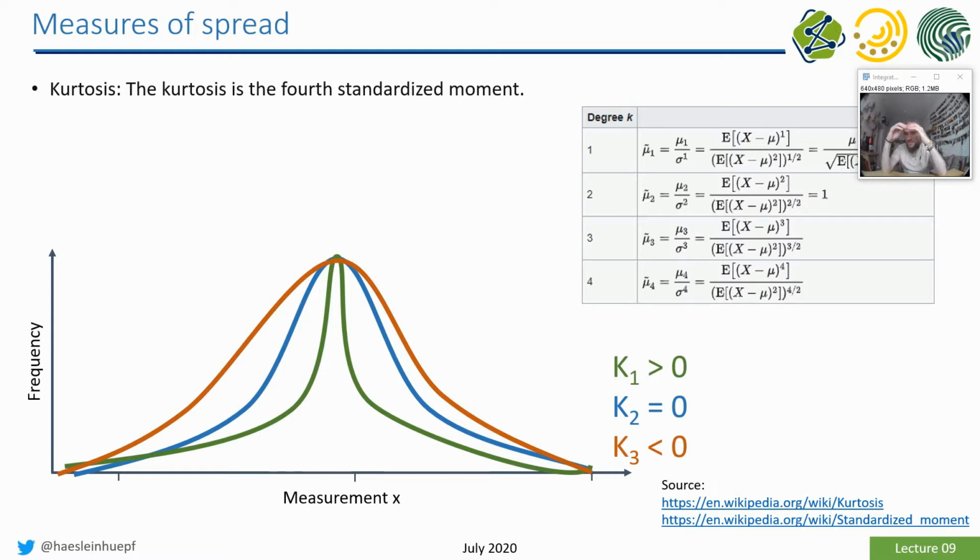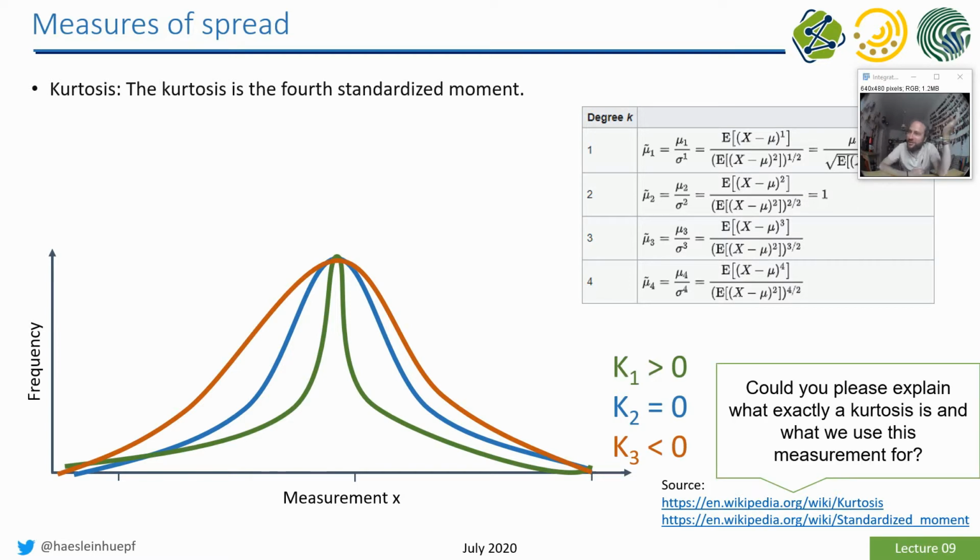It's not that there is an obvious use case where this can be utilized to measure a particular physiological property of a cell. But if you think about it, the mean of a measurement is the so-called first moment. The standard deviation represents the second moment.